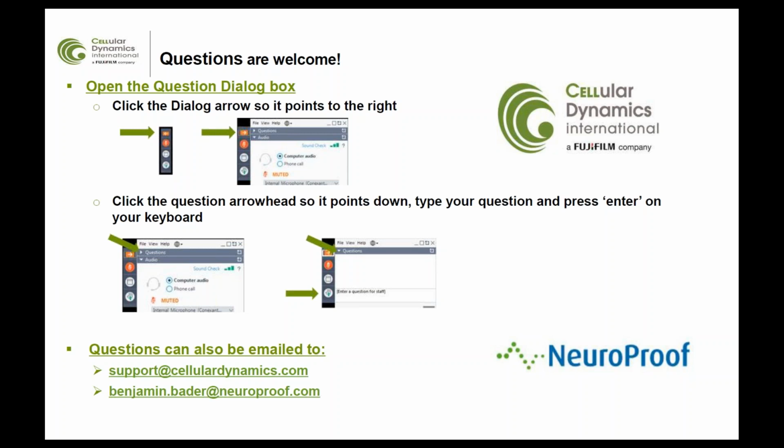Yeah, if I can add to that, as Ben's presentation really highlighted, there's a strong database of the mouse work to which the human cells as a new model is being compared. And we already see areas where this new model is surpassing the benchmarks of the mouse model. On top of that, one of the small panels that Ben also presented was looking at that Parkinson effect.